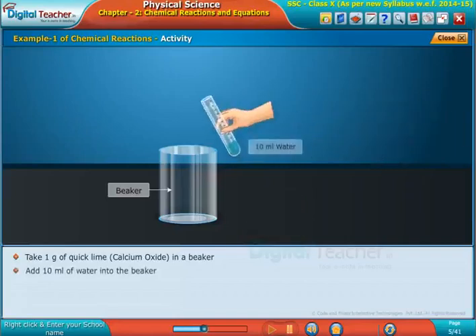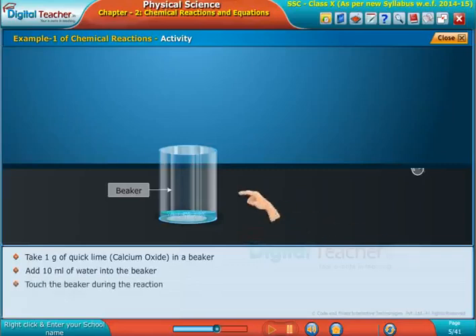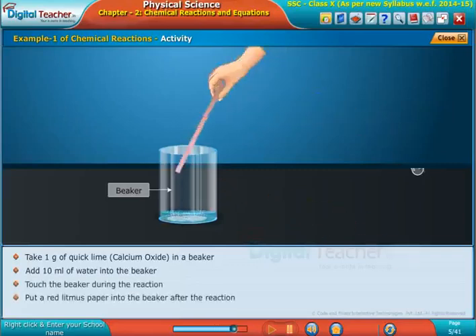Add 10 ml of water into the beaker. Touch the beaker during the reaction. Put a red litmus paper into the beaker after the reaction.